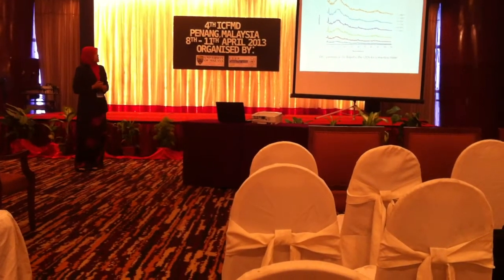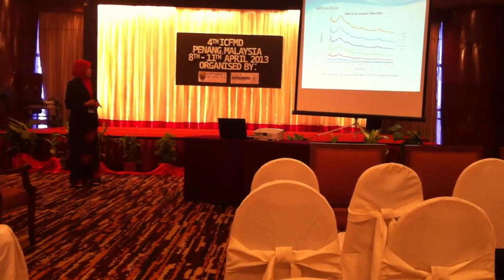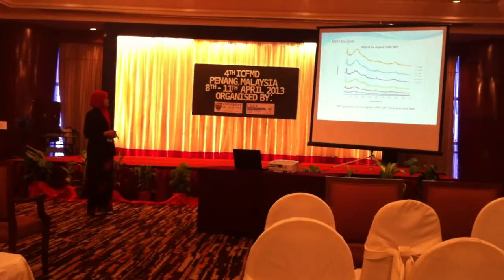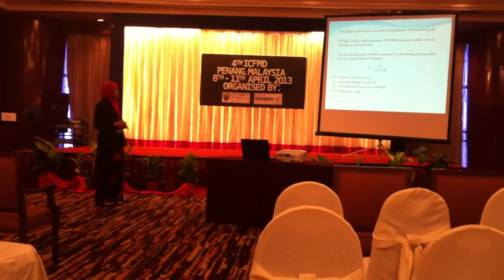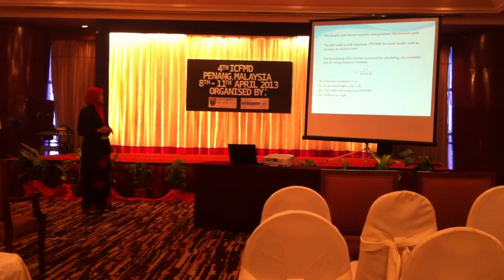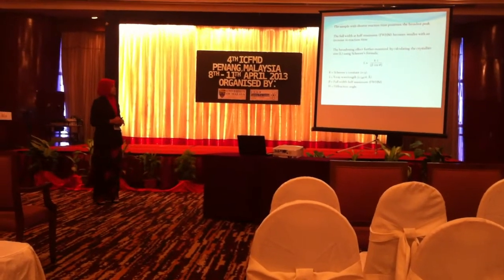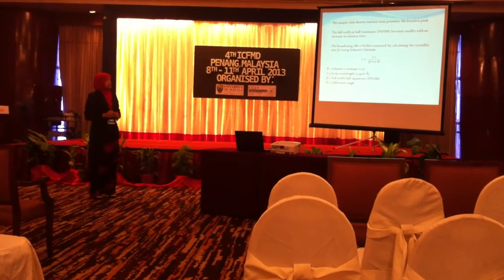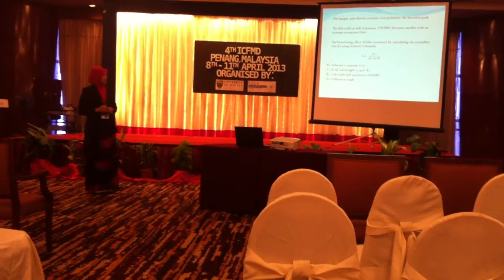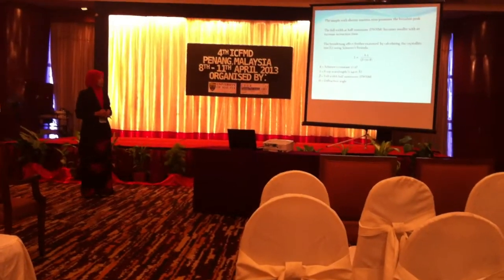Okay, the last result is X-ray diffraction analysis. The XRD patterns of zinc-doped samples are shown for several reaction times in this analysis. The sample with shorter reaction time possesses the broadest peak, and the full width at half maximum can be obtained from the analysis, and it shows it is smaller with an increase in reaction time. The broadening effect is further examined by calculating the crystallite size from the Scherrer formula.